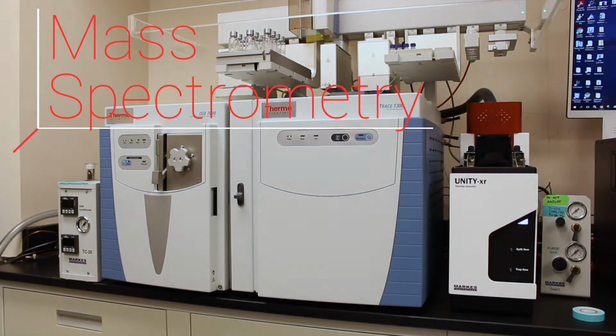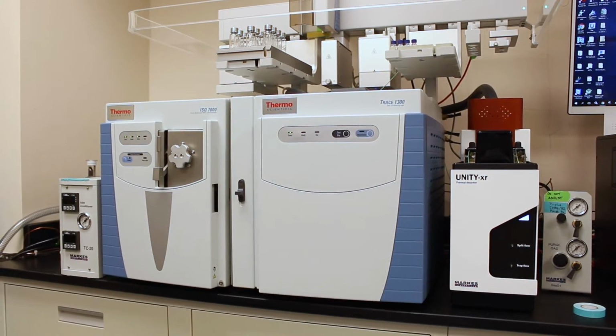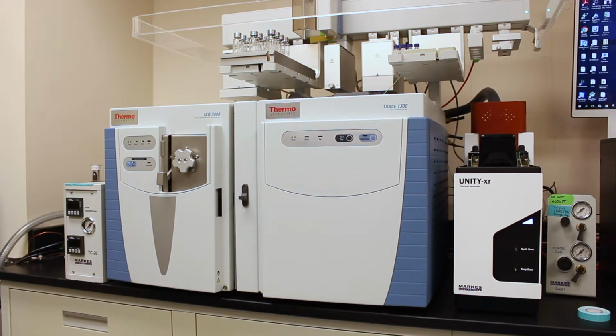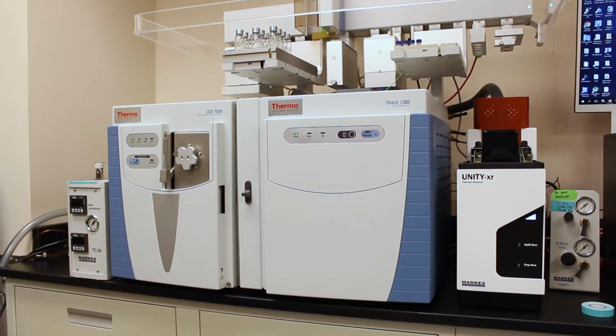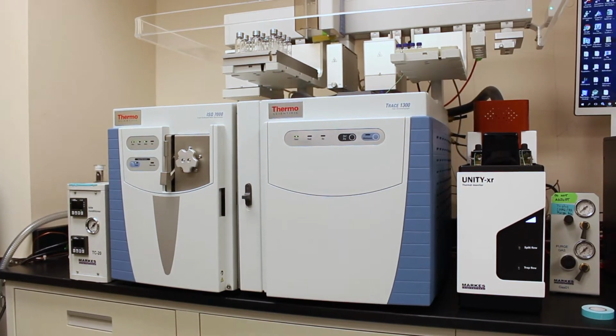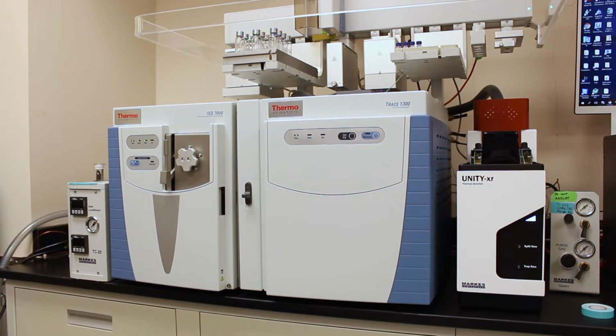All right, so for this week in Organic Chemistry Lab, we're discussing mass spectrometry. So it's not to be confused with mass spectroscopy. Spectroscopy is a term used to describe the interaction of matter and electromagnetic radiation. And then spectrometry is more so the measuring of atoms or molecules.